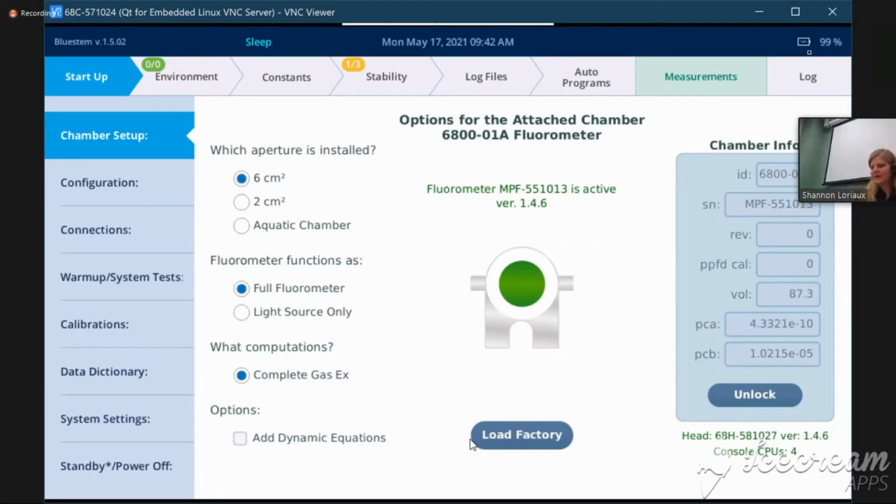If you unplug, and you don't need to do this since you're charging the batteries, but I will go ahead and unplug, you'll notice how that connector changes. So now instead of the battery with a squiggle, I have a battery with a life indicator, and it tells me about how much charge I have left. And again, you can see I have about 99% charge.